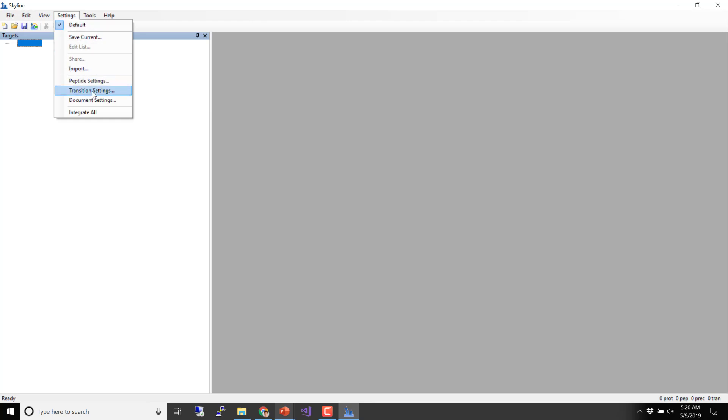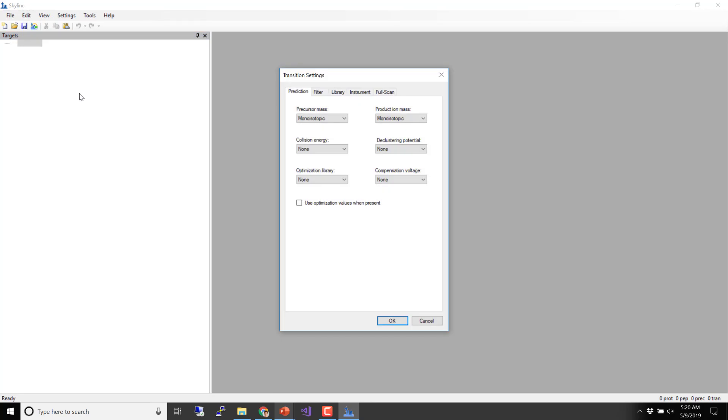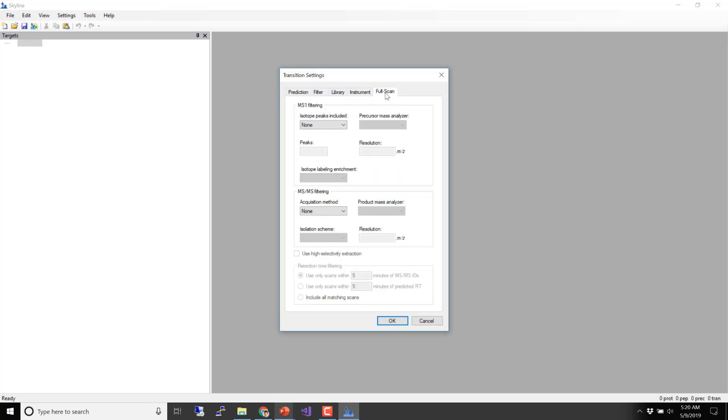The first place we'll go is the Transition Settings. There's really creating a Skyline template that you're going to import data into, choosing your targets, and choosing your settings. It's usually a good idea to choose your settings first. Go to Transition Settings and start on the Full Scan tab. When dealing with DIA data, that's where I like to start.